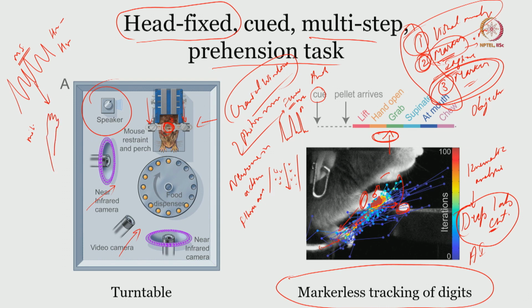So in which step what sort of neural spike you are getting would help immensely in decoding the neural signals that you have captured. If decoding is involved in the neural data capture, you need to make sure that your video and the neural signals are all synchronized. That is very, very important.